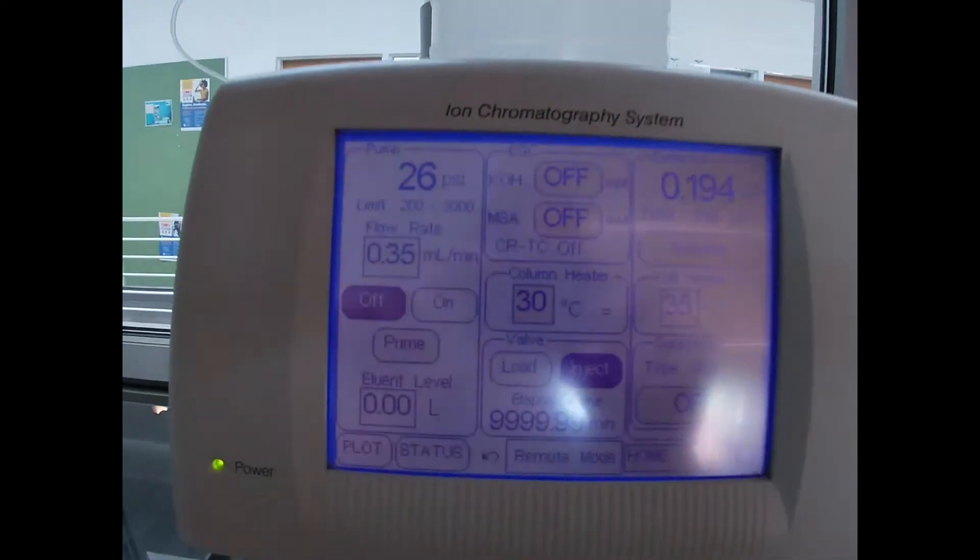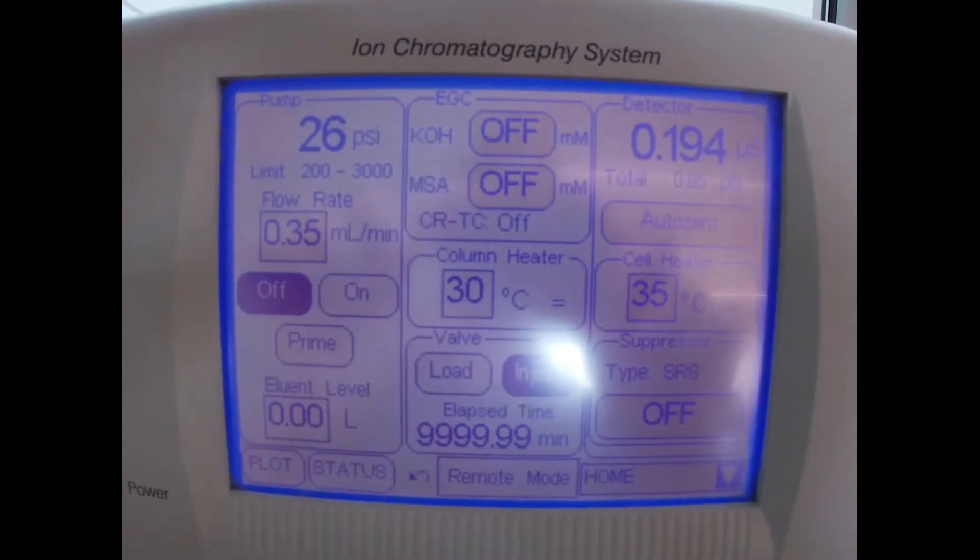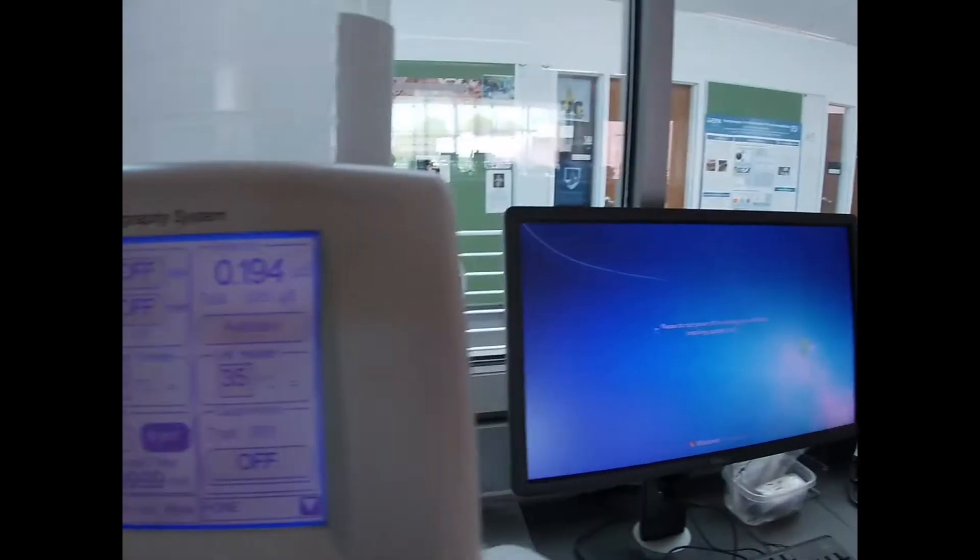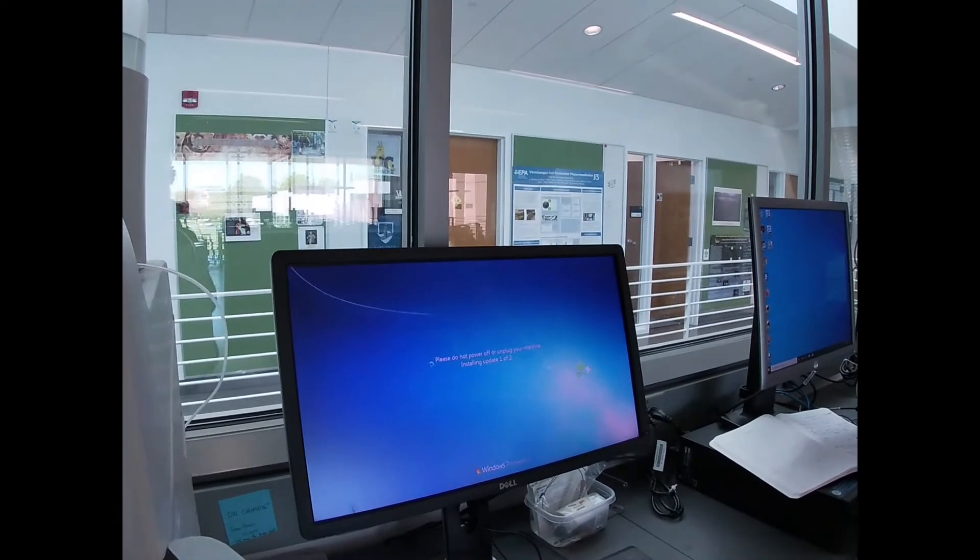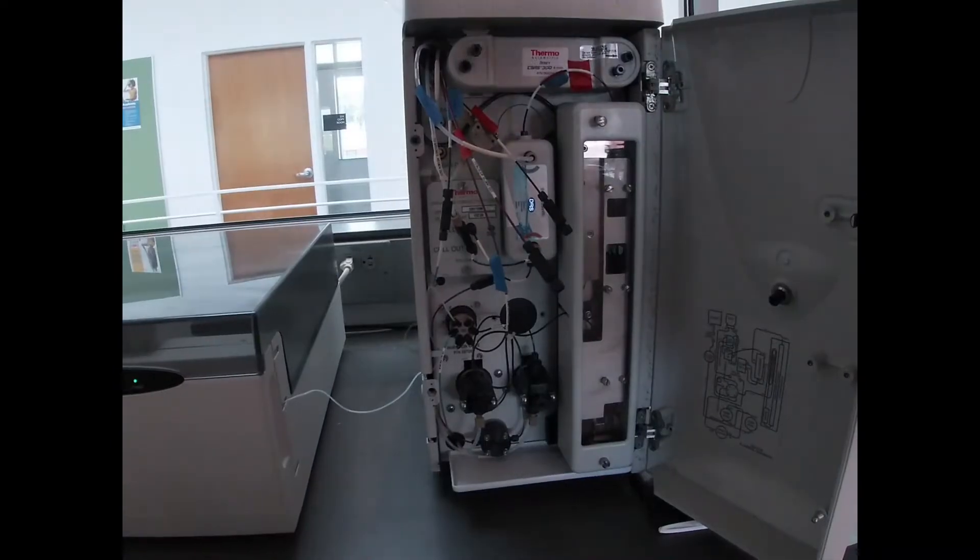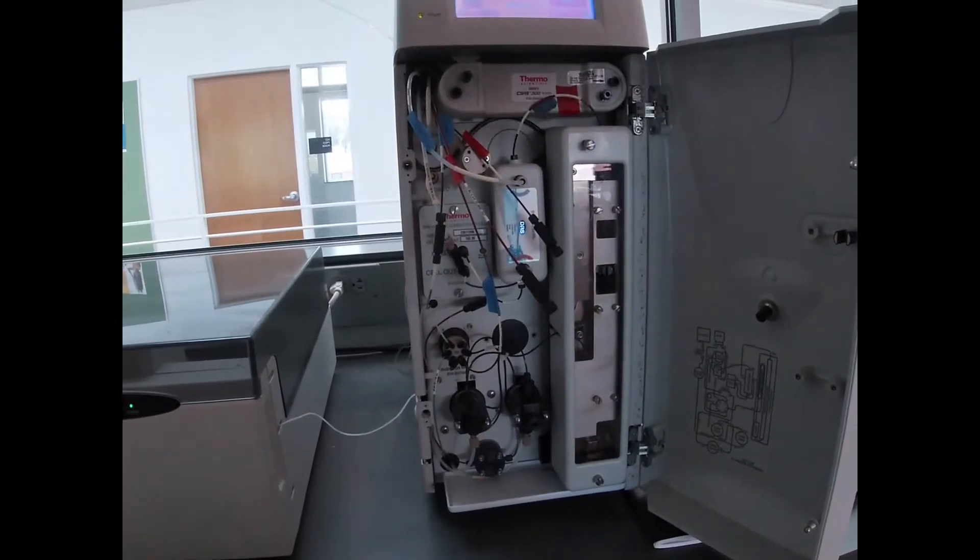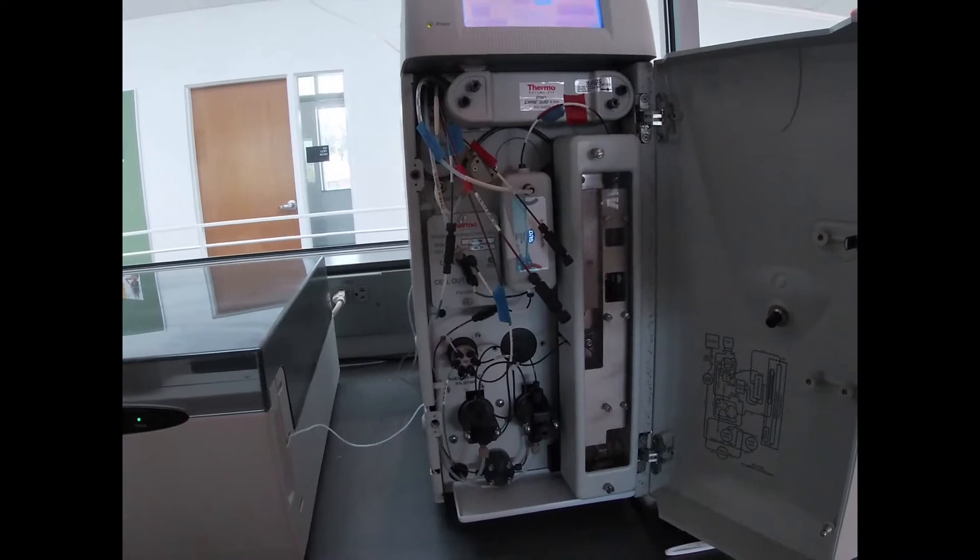So this is our little operating station if we're going to do this using the instrument, or we can actually use software, but right now our computer is not very happy. So here we are looking at our ICS2100 from Thermo-Dionex.